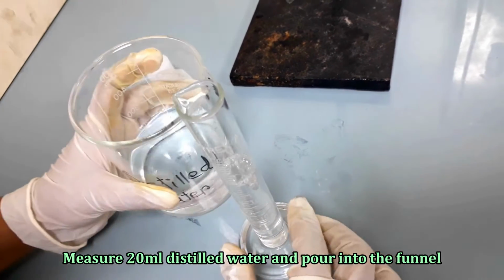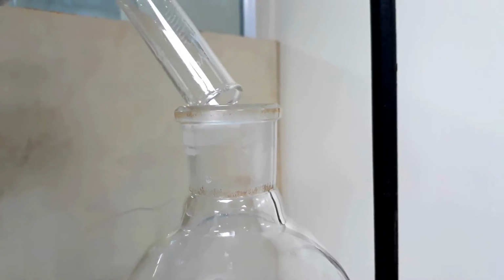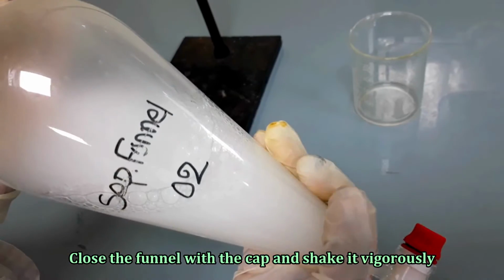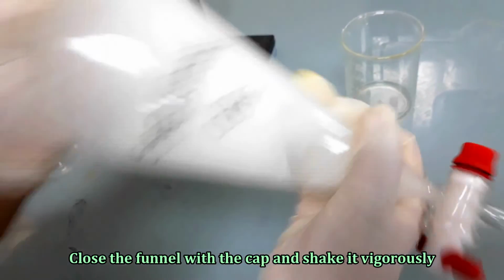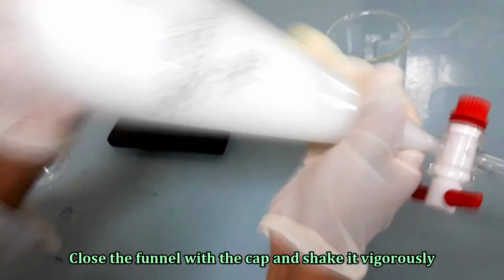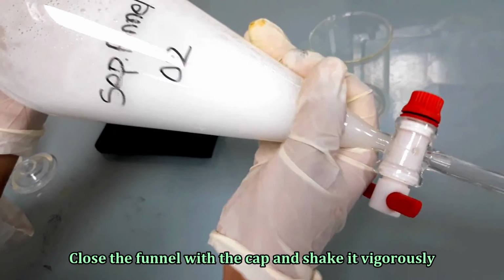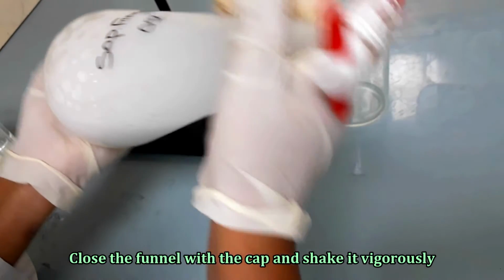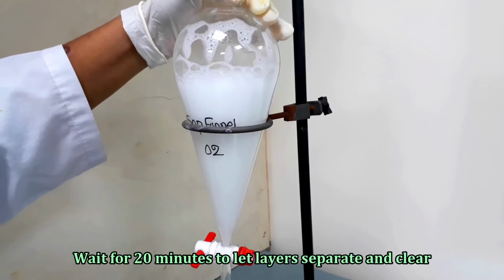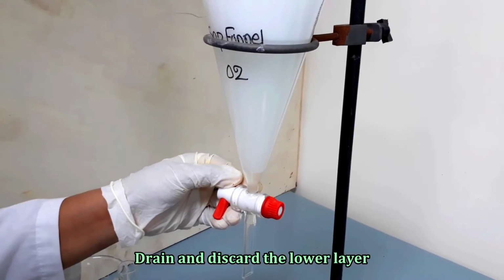Add 20 ml distilled water into the separating funnel too. Close the funnel with the cap and shake vigorously. Wait for 20 minutes to let layers separate and clear. Drain and discard the lower aqueous layer.